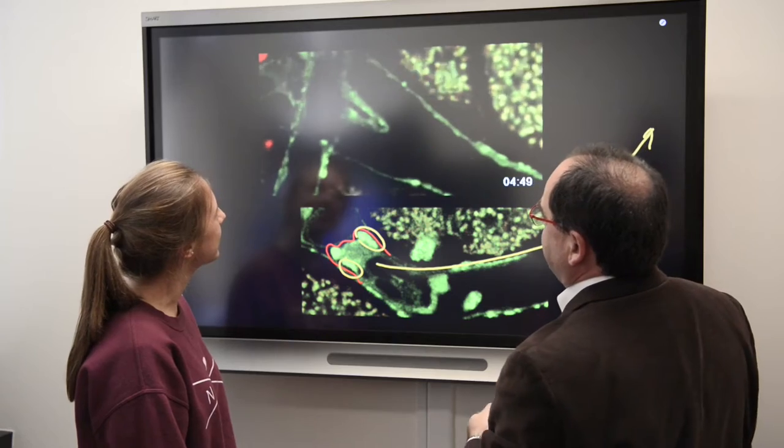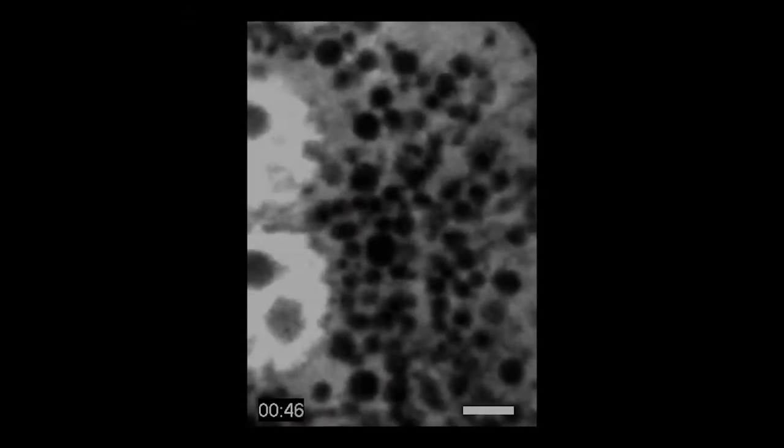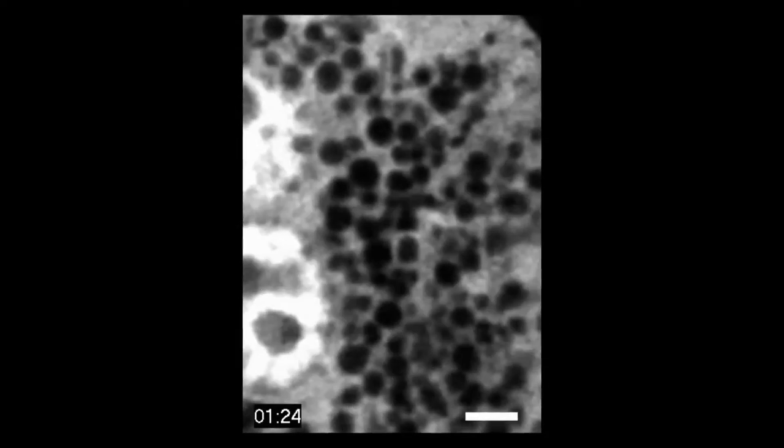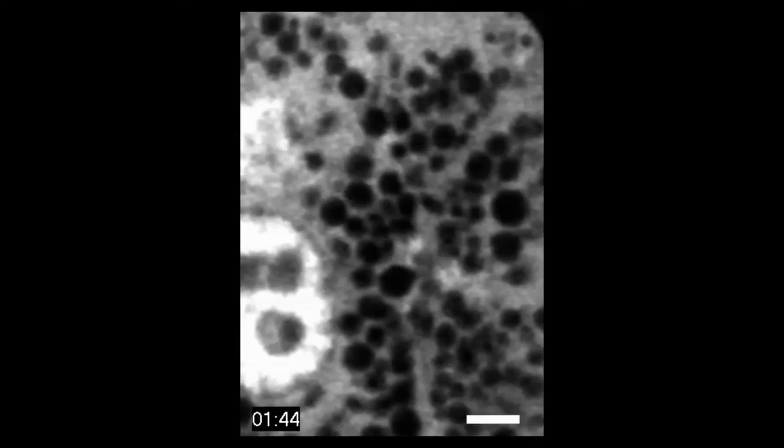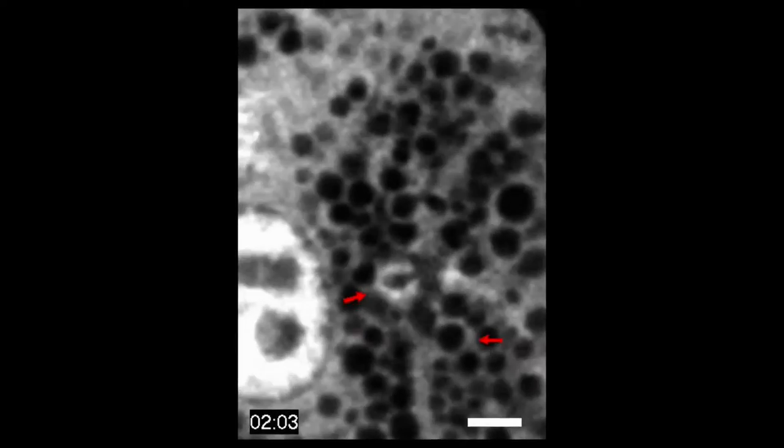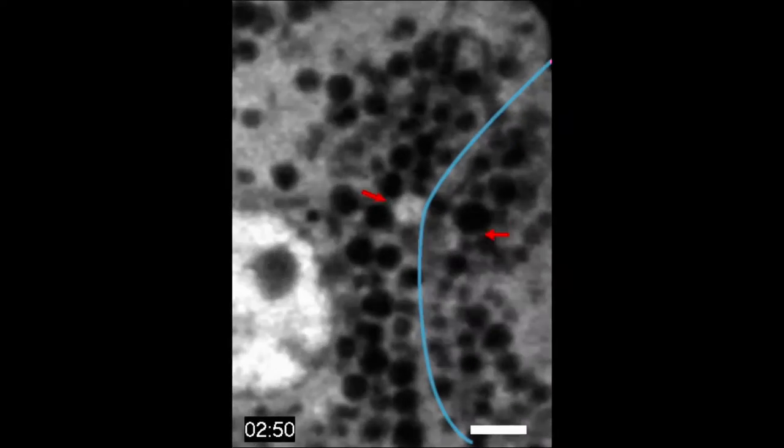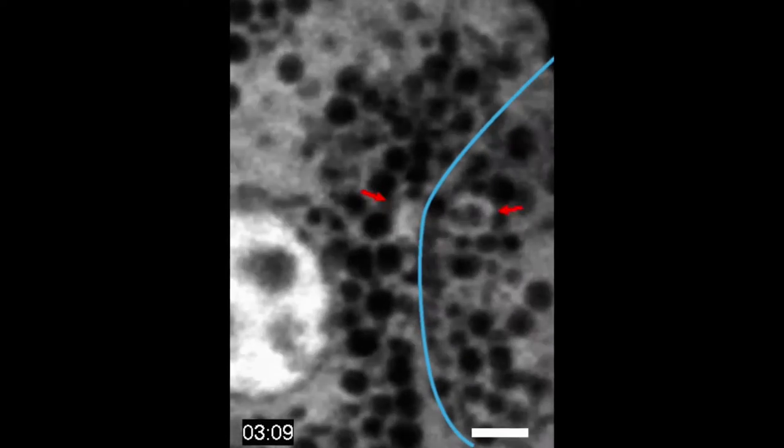This process cannot be reproduced in cell culture. In this movie, you can see secretory vesicles in the salivary glands, highlighted by the red arrows, that fuse and are integrated into the plasma membrane, the blue line. This is a beautiful example of membrane remodeling.